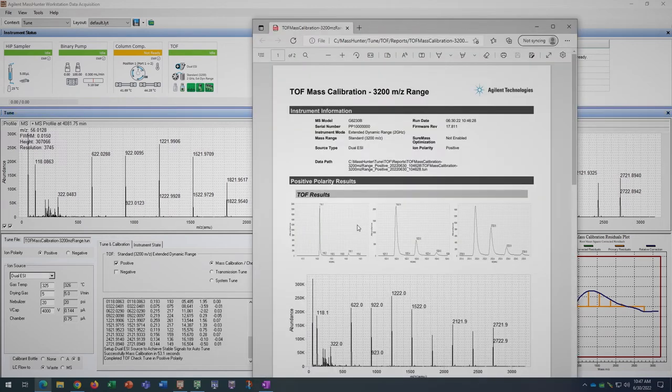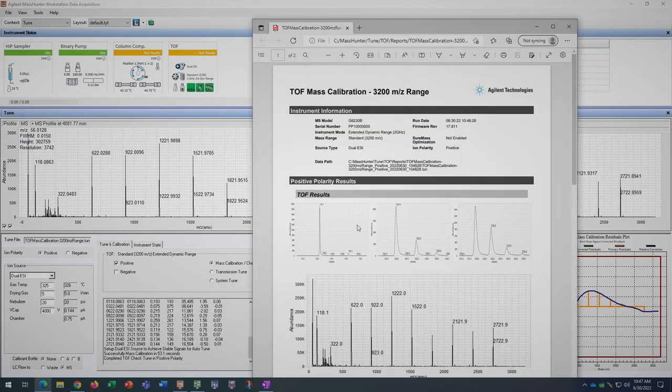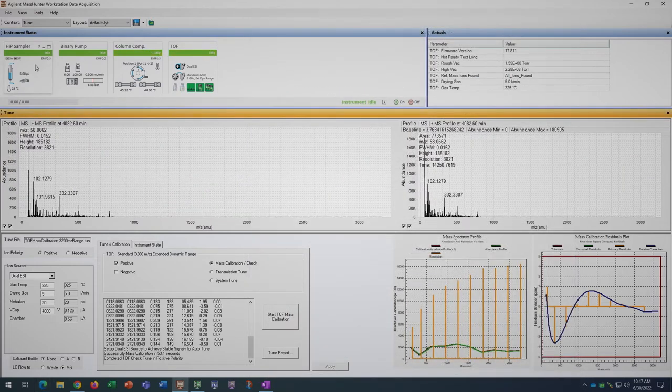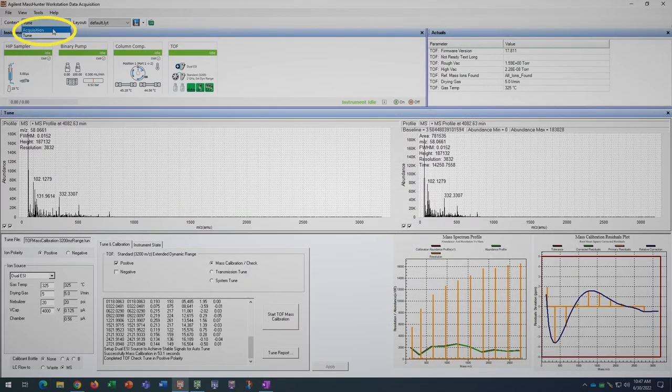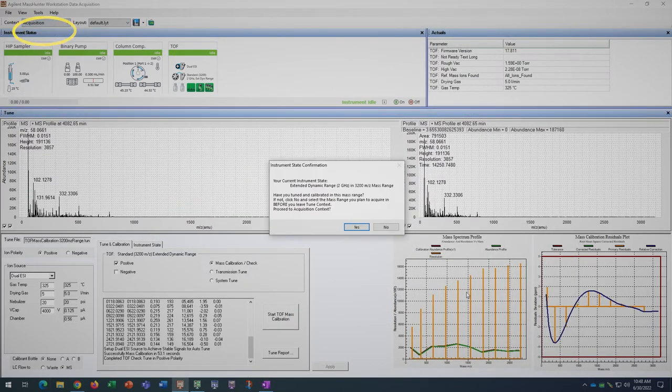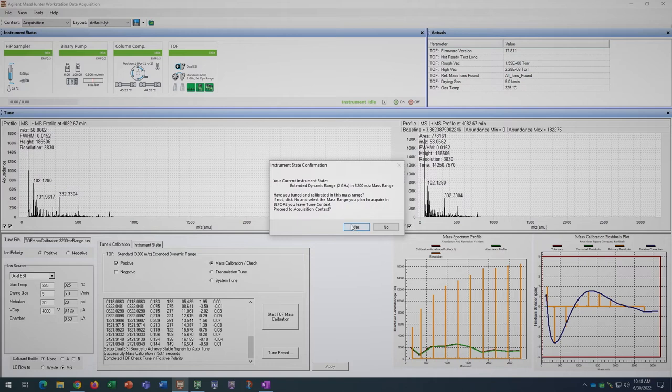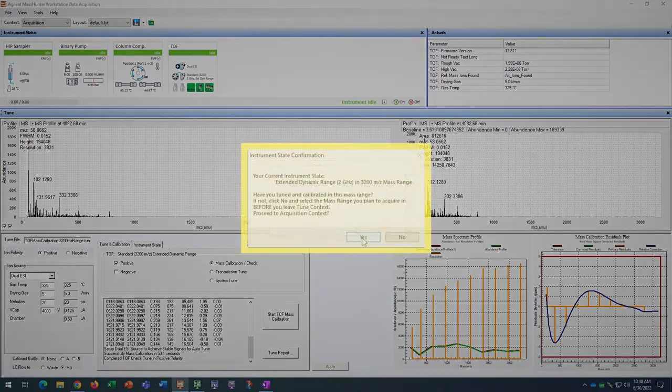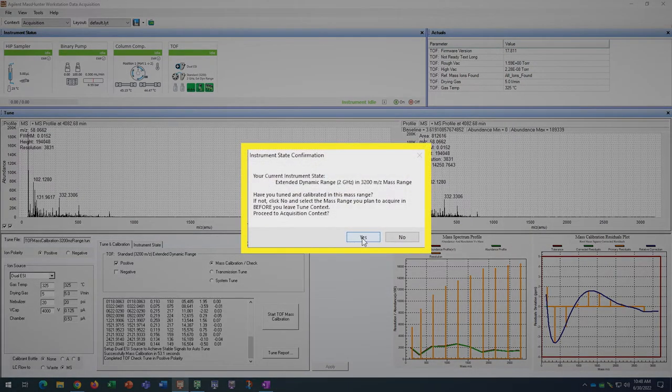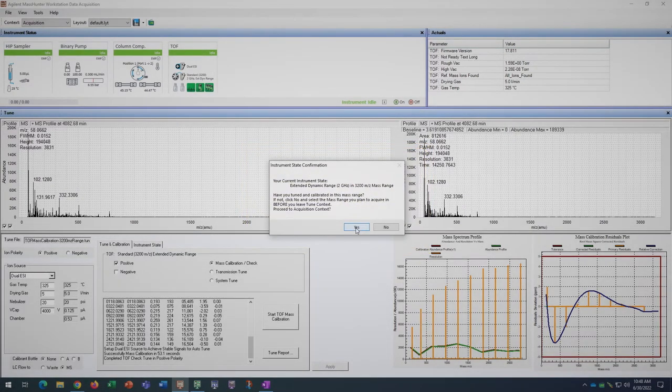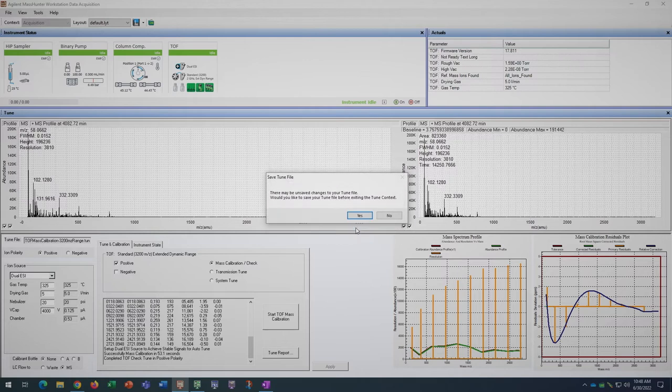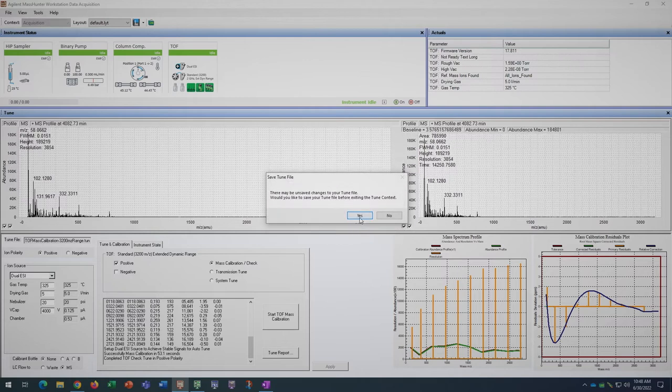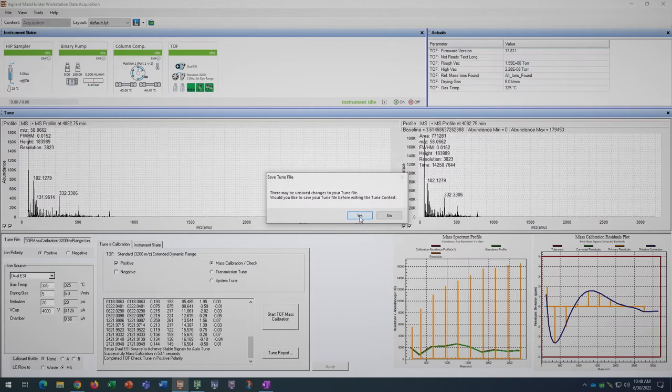You can exit out of this and switch the software context back to acquisition. Click yes when it asks you to proceed to acquisition context. You may save the tune file if the tune was completed successfully.